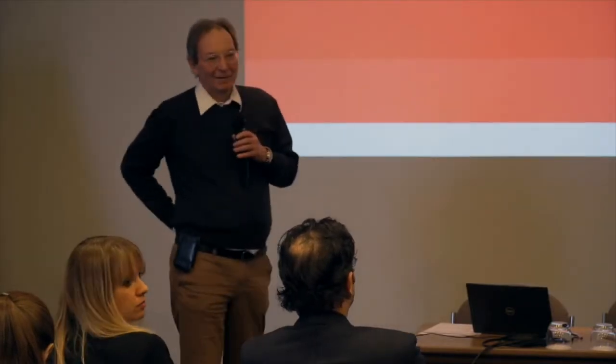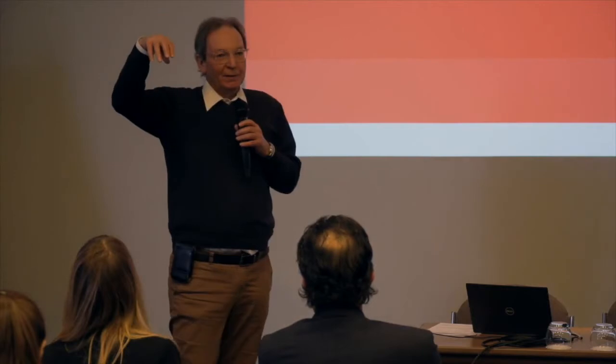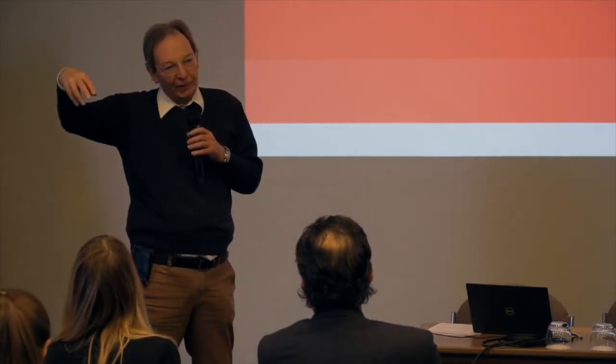Other questions? Q. Can we imagine the process in two steps, a low resolution step to have a sort of image of the A4 tape, and then refine with high resolution? Yeah, that's actually one of the things I hoped somebody would ask. That is what I would do from a practical point of view: you have the whole area scanned in low res and then go to the real points of interest and analyze them much deeper. That would be an option.